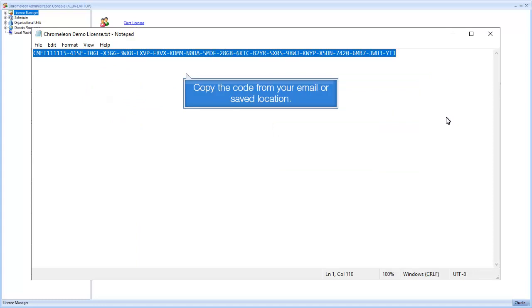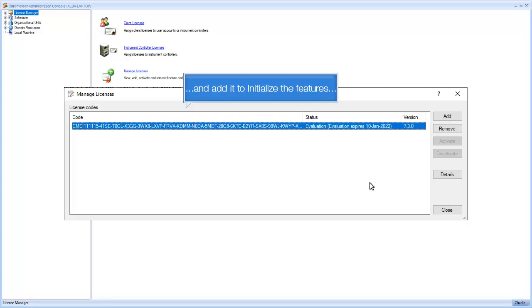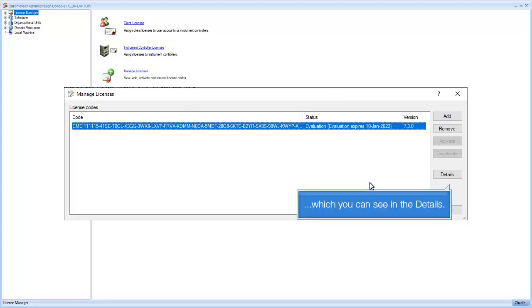Copy the code from your email or safe location and add it to initialize the features, which you can see in the details.